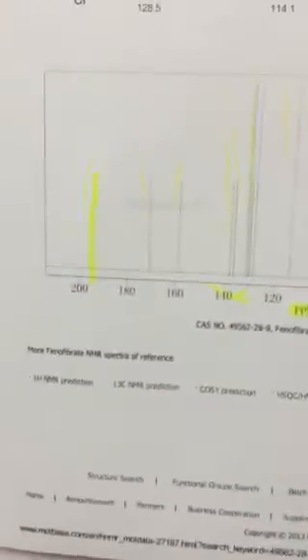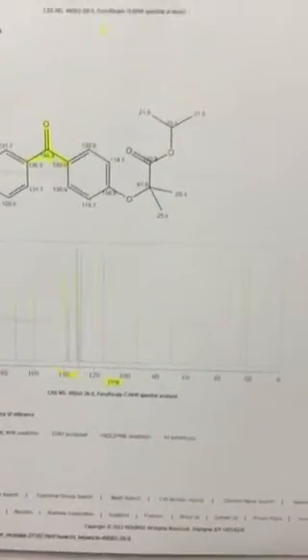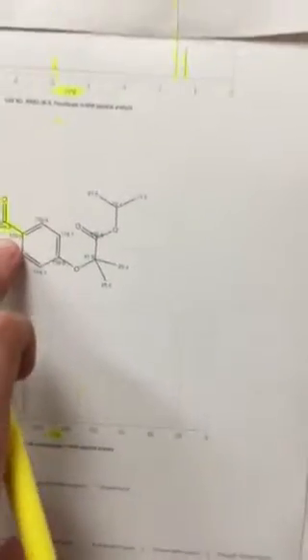So if we go back down into our chart, we notice right over here that there is a signal given off at 194.3-ish. I like to say ish because I cannot determine exactly between those two numbers, 180 and 200, where it is. But judging by my diagram up here, we can make an educated guess that that's exactly what we're dealing with. So this is the signal that this carbon is giving off. And these carbons are all designated throughout the entire spectrum. We're dealing with signals being given off by the carbons, and signals given off by the hydrogens in the H1 NMR and the C13 NMR spectrums.